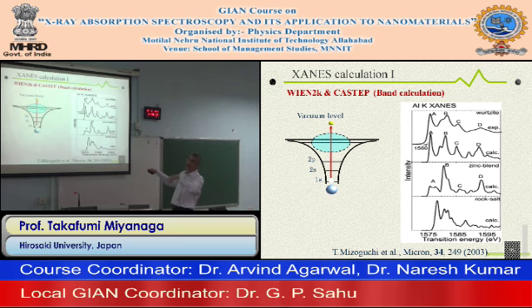There is a nice, sharp peak before the edge. But very close to the edge, the quasi-unoccupied level appears around here. So this concept is from there.